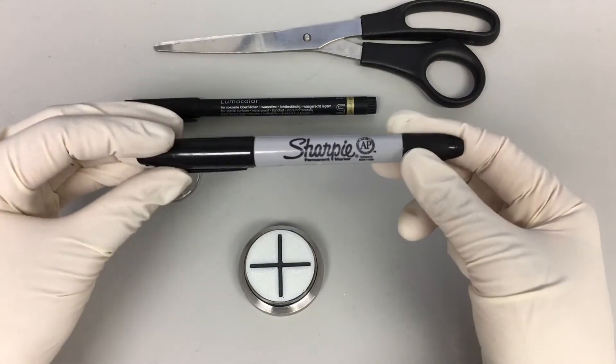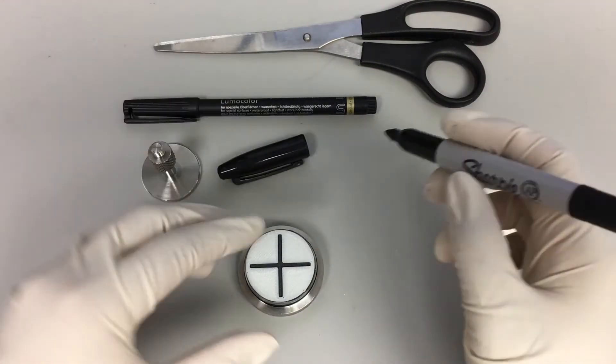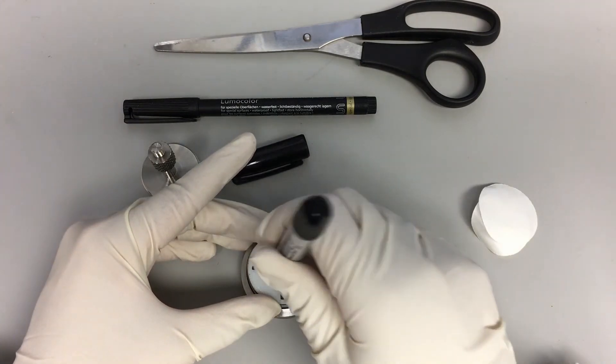Using a permanent marker, trace a cross on the sandpaper side of the sample holder by using a circular stencil with a diameter of 37mm.